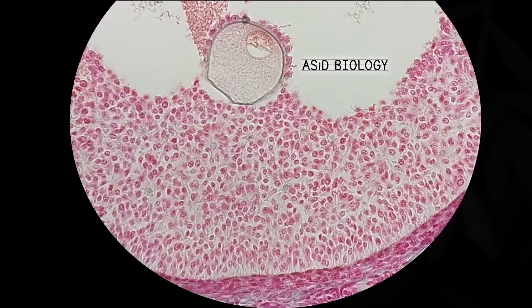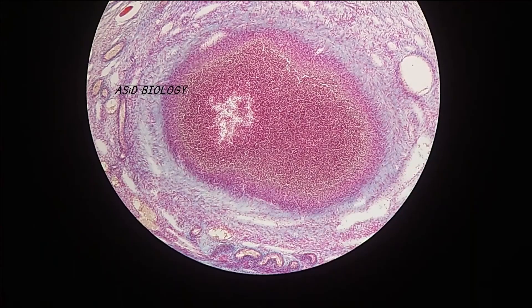If we zoom into the secondary follicle, we can see the secondary oocyte. This secondary oocyte will be released during ovulation. After ovulation, the remaining tissue will be transformed into corpus luteum. Corpus luteum is also able to secrete hormones inside the ovary.